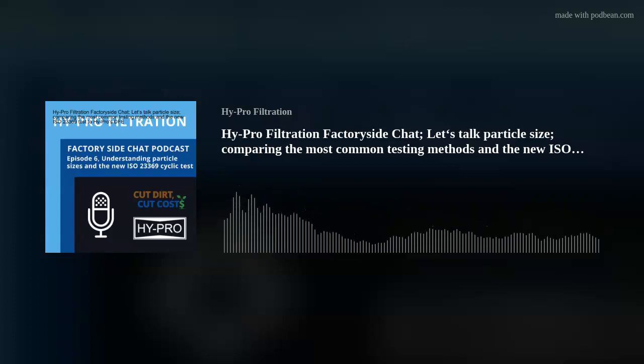So that brings up a couple questions. One of them is, you said the 4 channel. What are the channels that we'd like to focus on as far as the lab report? The 4 micron, 6 micron, and 14 micron. Those are the 3 channels that make up your ISO code. Okay, and the 4 micron channel would include all the 6 and 14, and then the 6 would include the 14 as well? That's correct. So it's greater than or equal to 4 micron, then greater than or equal to 6 micron, and greater than or equal to 14 micron.